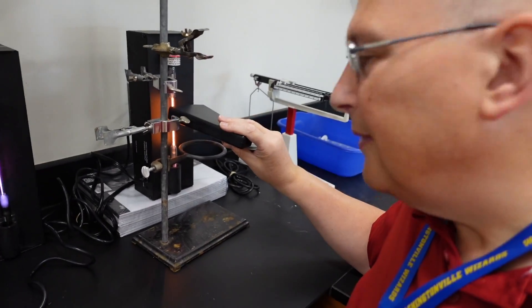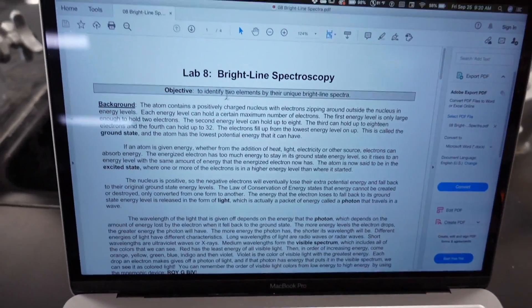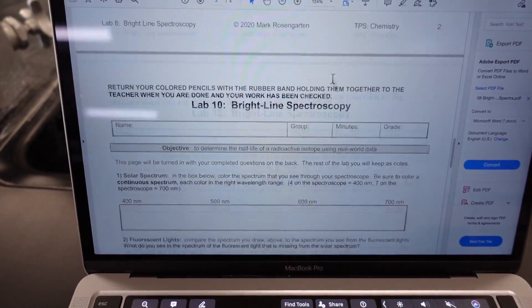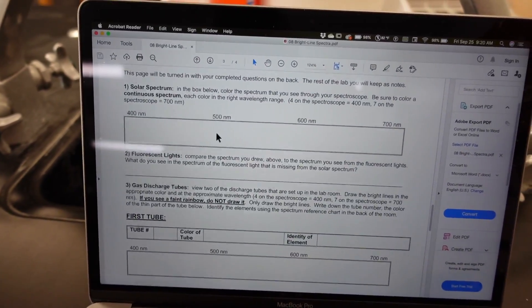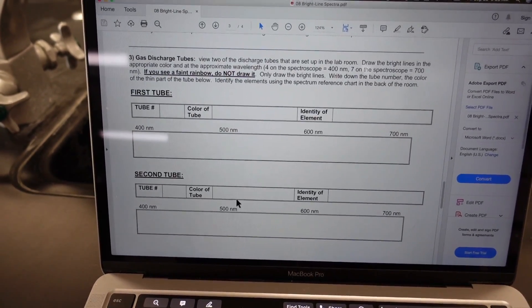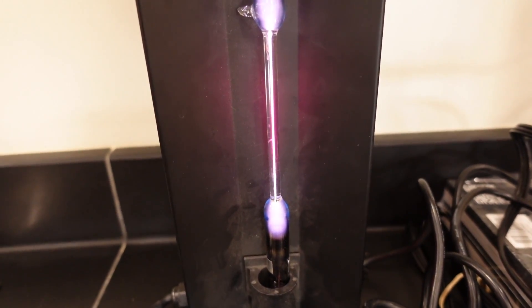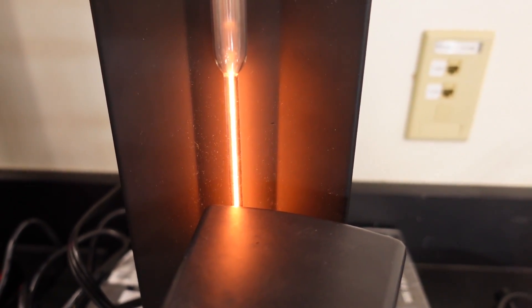I'm going to have this sitting right here looking at it, and I'm going to have the camera looking through that diffraction grating so you can actually draw what you see. In the lab it says you're going to use colored pencil, but if you're going to use Canva, just use colored lines because you can select whatever color you want from the color palette — you can even draw blocks of color. So on your bright line spectroscopy lab, you are simply going to draw each spectrum of each tube: tube number one, tube number two. What is the color of the tube? Here's tube number one — what color would you call that? Here's tube number two — what color would you call that?